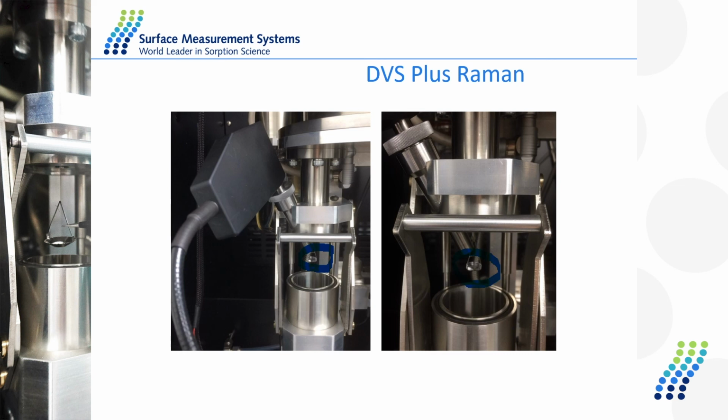And what we do is we load our sample in here and we measure the Raman spectra at the end of each partial pressure stage, and we record automatically all the spectra together. So we can measure the difference between each spectra at the end of each stage and identify if there is a transition in the spectra.